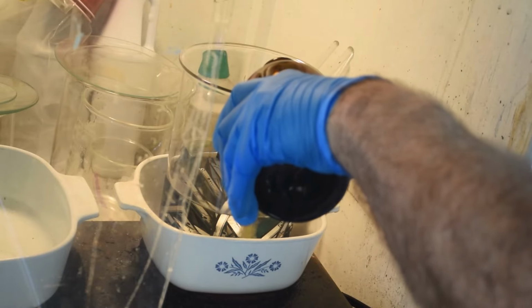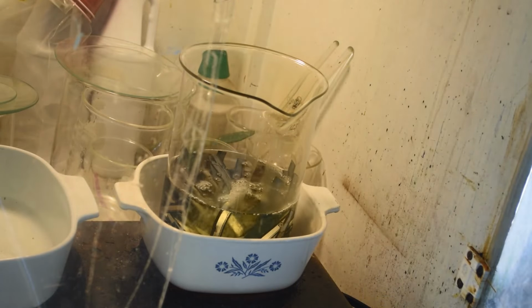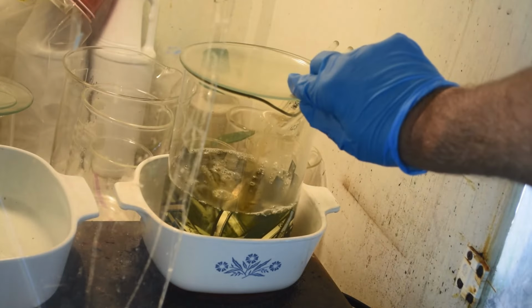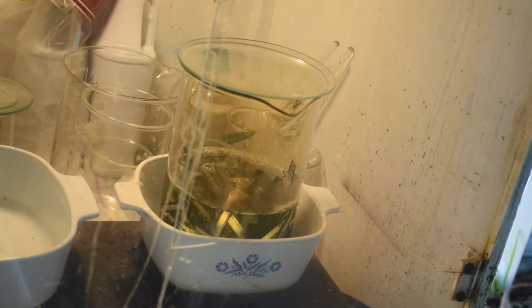So I'm just going to sort of eyeball it a bit. Whoa, hey, we got us a reaction going on. Look at that. Put a watch glass on it. We'll let that go. Yeah, we're already getting some orange fumes in there. So the nitric acid's attacking something. There's clearly some kind of metal there that nitric acid can attack.